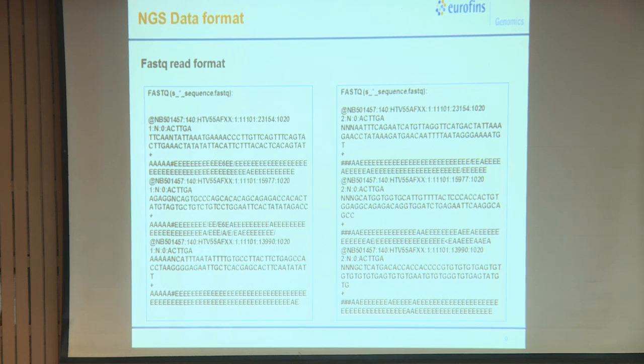Each flow cell has its tiling. You have an imaging system to capture the sequencing. The clusters which are formed with bridge amplification, with the intensity they capture the color. So, which tile it is, which position, all this information is written in the header. And the important part is this 1 and this 2. The entire header will be the same for these two sequences, only the difference will be 1 and 2. This is how any software or assembler will identify this is my forward read or this is my reverse read, based on which library you are using.